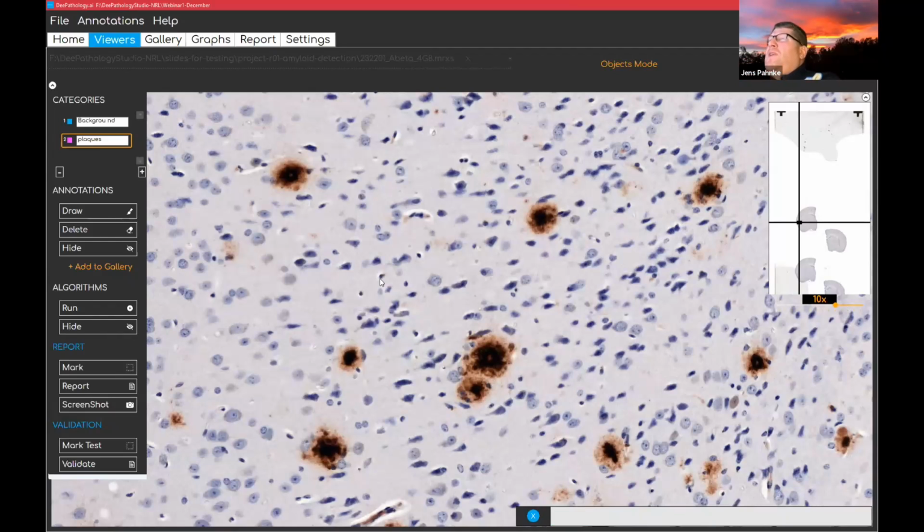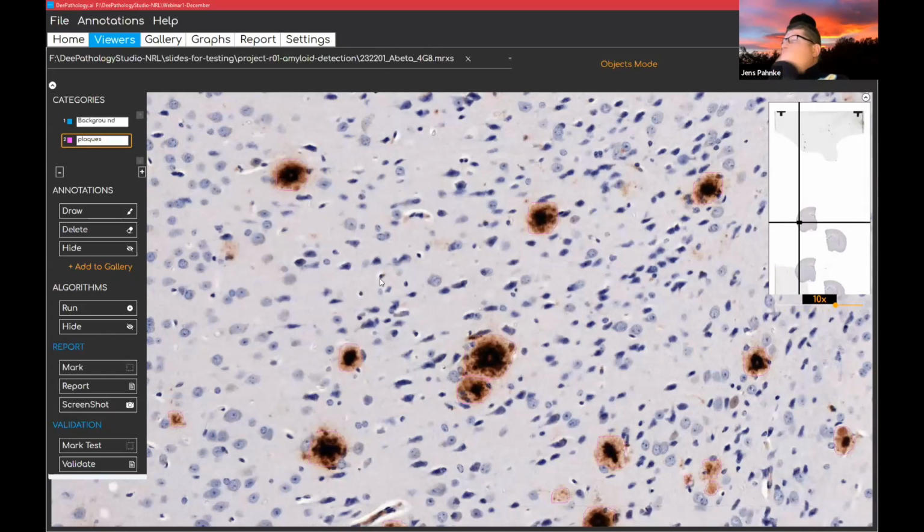So the good thing is, when you run this in between, you can control for new objects that you want to add for the learning. And you can also run the learning overnight, but then you have no control in between. It's not necessary actually because it's quite fast, and usually I stop it after a while when I see that it's working perfectly. So now we have seen the detection here. This is our test.